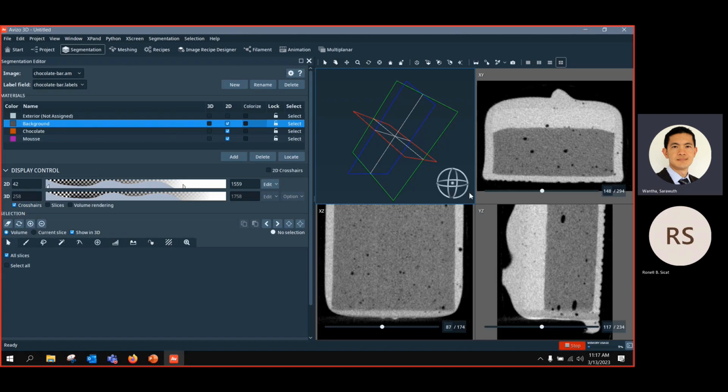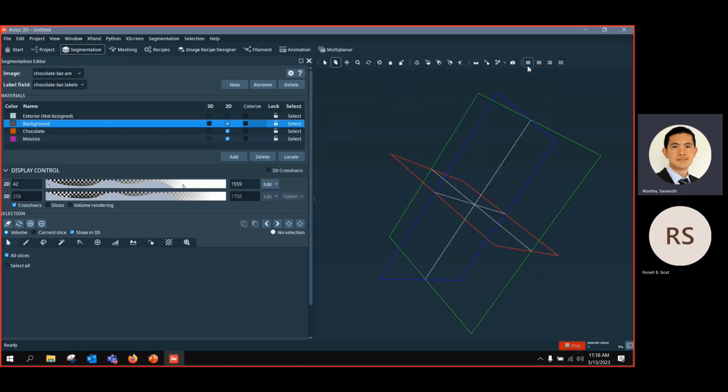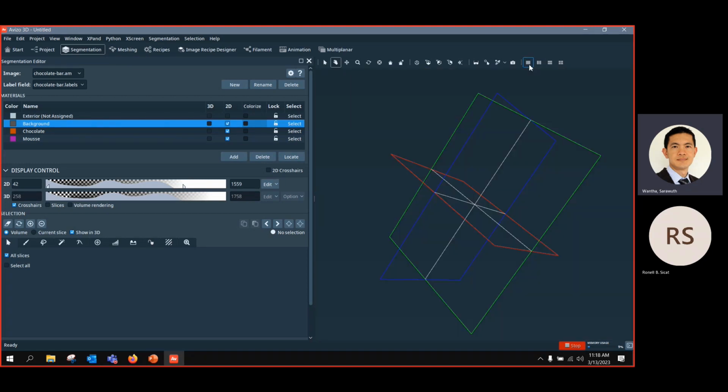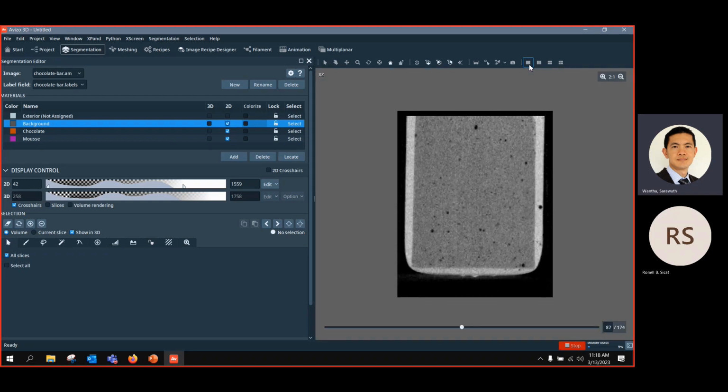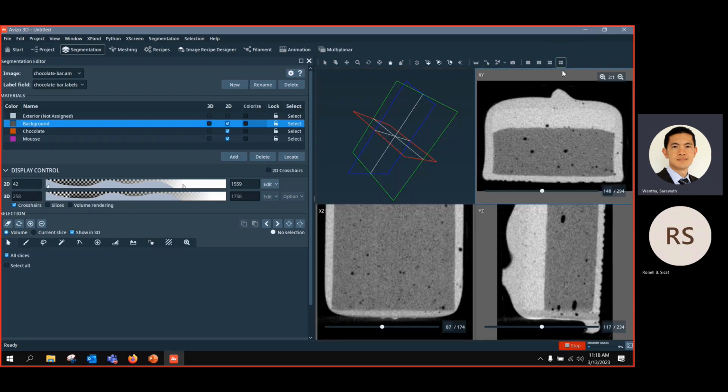And then on the right side, we have this viewer. Usually you have 4 viewers, or you can do 2 viewers, even 1 viewer. But if you stay on 1 viewer, you can click to cycle between the 4. So from the 3D viewer, XY, XZ, and YZ, something like this. So for the beginning, I will stay with 4 viewers, easier.